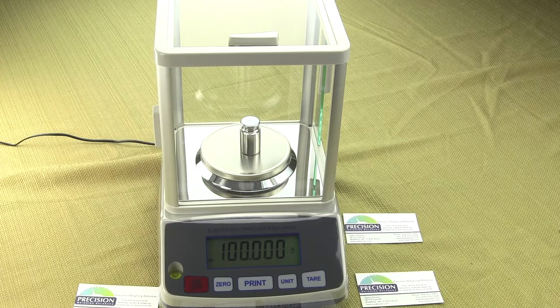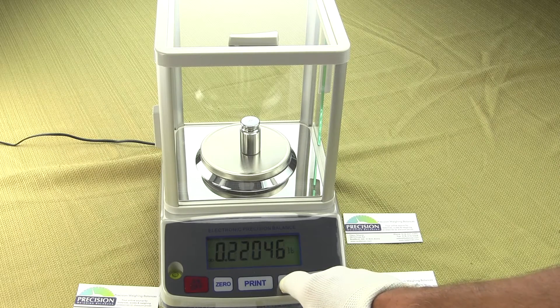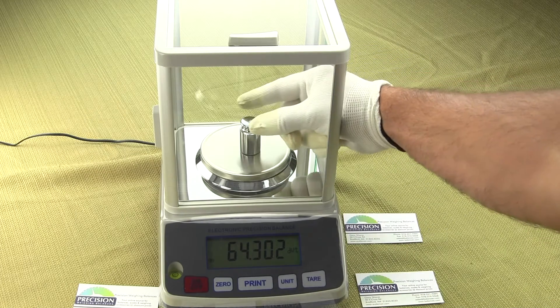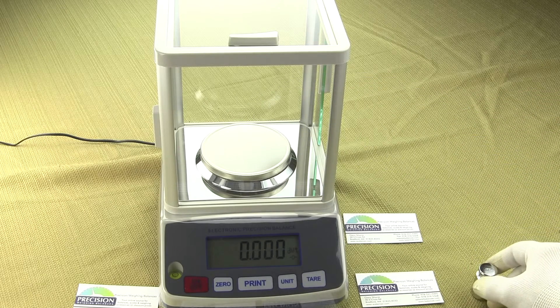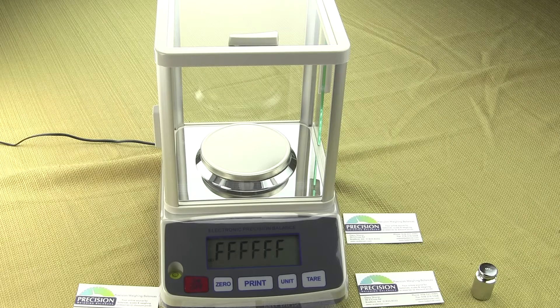Another nice feature is you can change the weight unit. For example, if we go to penny weight, the balance is now in penny weight. If you were to shut off the balance and power it back up, it will go through the power-up sequence but remember the last weight mode. Many comparable models in the marketplace always return to grams, so you'd have to change the weight mode each time — but not with this model. It will remember the last weight mode, and you'll notice it's now back in penny weight.